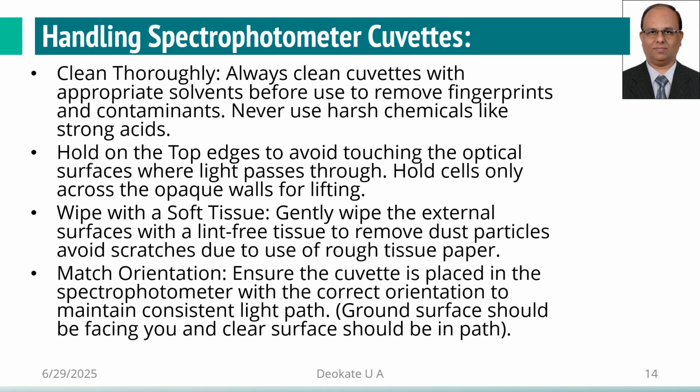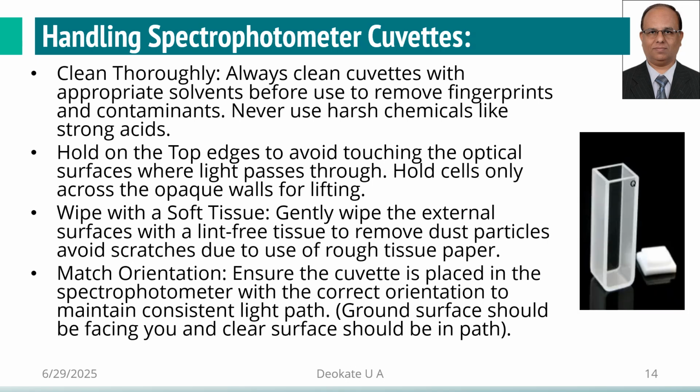Handling of this cuvette is very important. Clean thoroughly. Always clean the cuvettes with appropriate solvent before use to remove the fingerprints and contaminants. Never use harsh chemicals like strong acids or strong alkalis to clean such cuvettes. Hold on the top edges to avoid touching the optical surfaces where light passes through. Hold the cell only across the opaque wall for lifting.